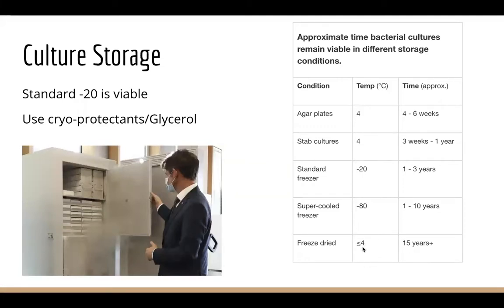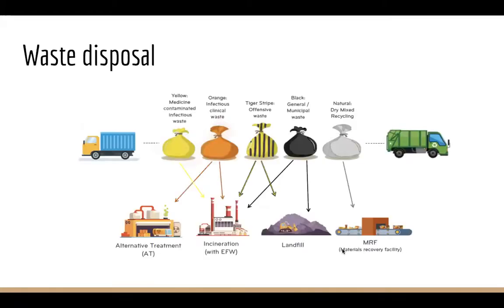Also, even at 4 degrees C, as long as it's sealed and there's no chance of any moisture getting in. And also when you're setting up your laboratory, you've got to be careful about waste disposal and safety. So especially if it's class 2, you should always talk with your local authority or university on setting up risk assessments, cost forms, just ensuring that you're actually doing the right thing.